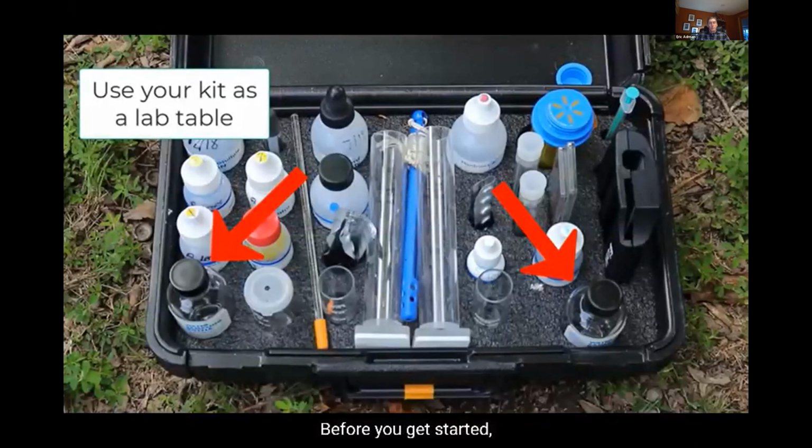Before you get started, make sure you position the sample bottles on a level surface. This may be difficult streamside, so we recommend that you keep them in your kit, using your kit as a lab table. This will prevent spills and protect your hands from chemicals.